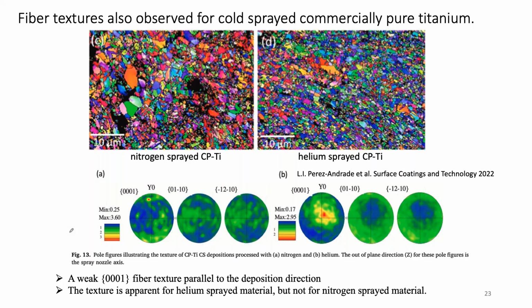Here's another example. This is some work by Dr. Lorena Perez, who works with me. Recently she published some work on cold spray of titanium. And in the case of commercially pure titanium, we use both nitrogen and helium spray gas.